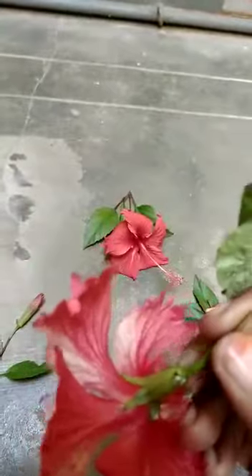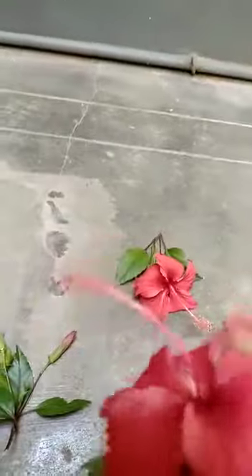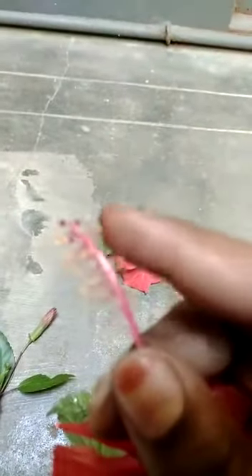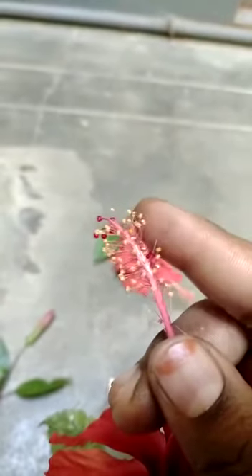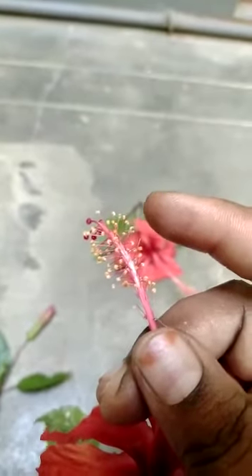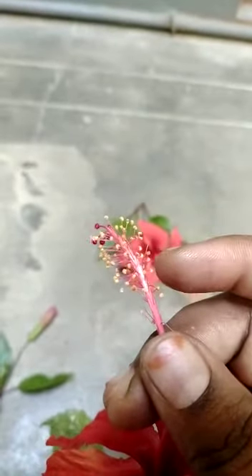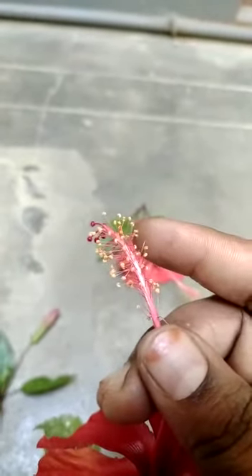The greener part is called sepals, or else it is called calyx. The bright red petals are also called corolla. Here you can see yellow-like dots which are called the anther, which is attached to the style through a filament. You can see very thin capillary-like structures attached to the gynoecium of this flower. The yellow part is called anther and it is connected to the style using the filament.